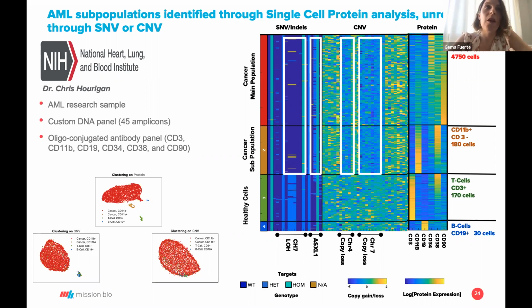If you want to study a larger region, like a chromosome arm, 5 to 12 will be great. Although if you are studying presence or absence, you could be okay with 5 or 6. It also comes down to cost, right? The more amplicons you have, the more information, but it is not necessary to have 200 amplicons to assess presence or absence. Probably 5 or 10 will be enough.